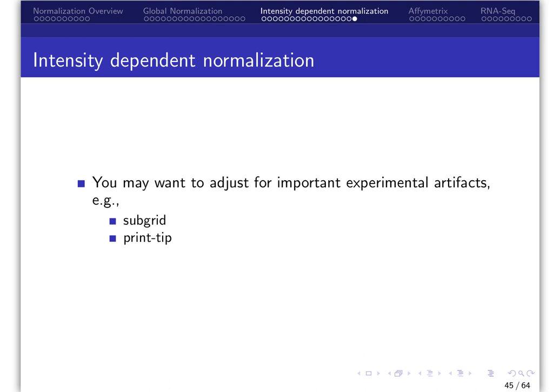Therefore, justification for adjusting the intensities by print tip is due to potential variability in length of print tips, diameter of tips which deposit the probes, deformation of the print tips as a result of continued use, etc. Normalization by print tips is usually accomplished by using robust locally weighted regression to model the intensity log ratios M on the predictor variables. Rather than apply this global Lowess normalization method, within print tip group Lowess may be preferred, whereby robust locally weighted regression of intensity log ratios M on the average log intensity A within print tip groups is fit. The adjustment c sub ijk is now the fitted value from the Lowess regression for the ith print tip, the jth spot on that print tip for the kth array.